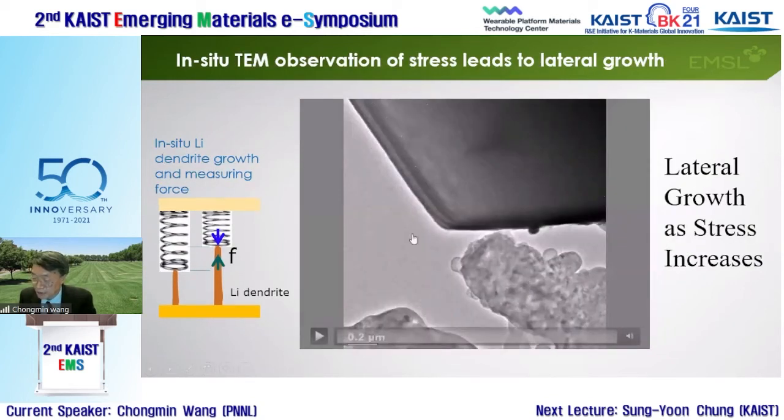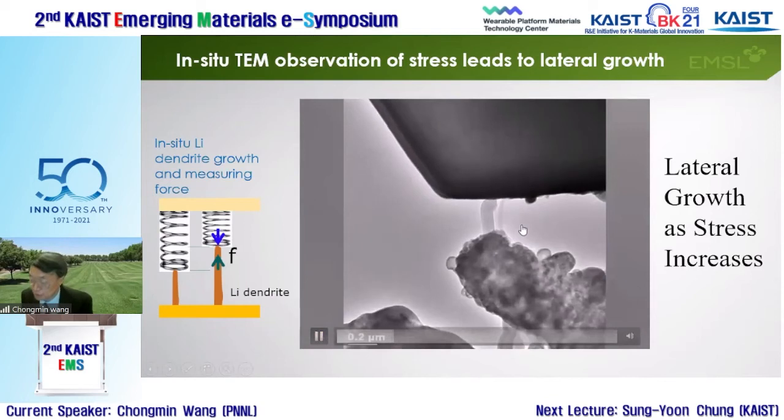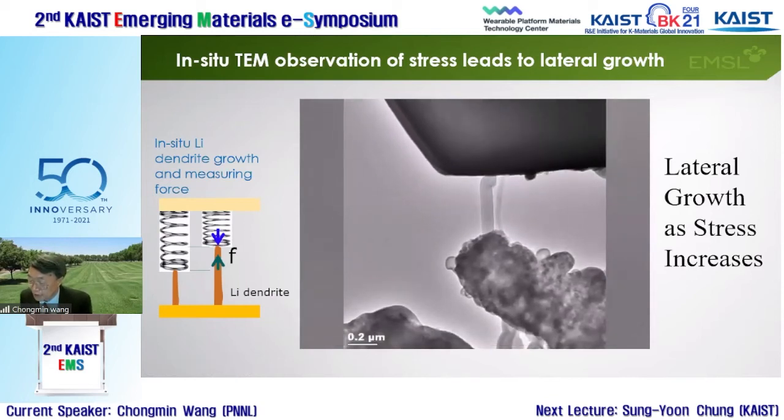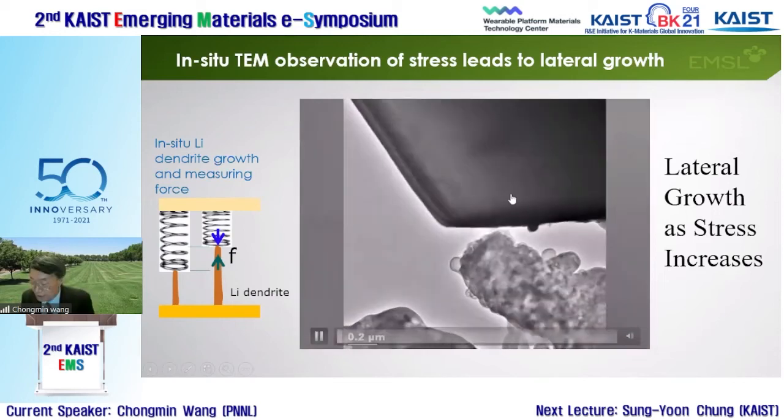And if there's too much stress in here, and again I think people know this, you can see it grew a little bit, and then the stress increased, and now it just becomes no longer, and then it becomes thicker and thicker. That's the stress factor. So this really indicates, when you build a battery and people overuse the stress, that you can regulate the lithium deposition morphology here as well.